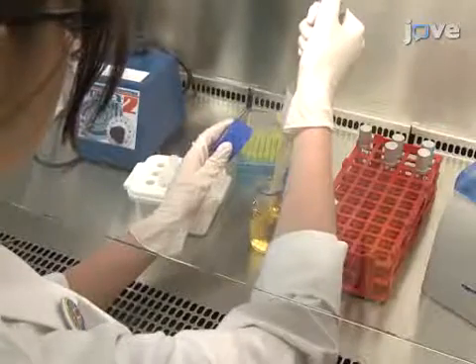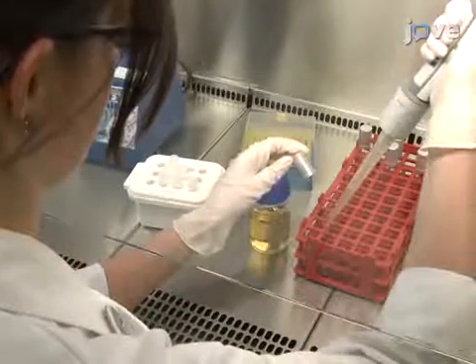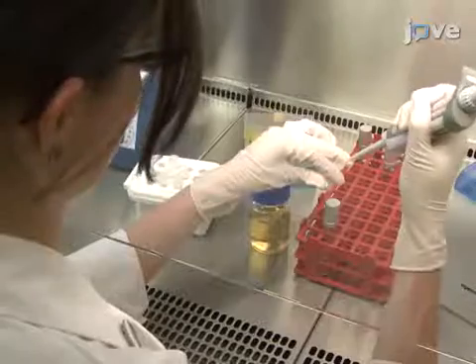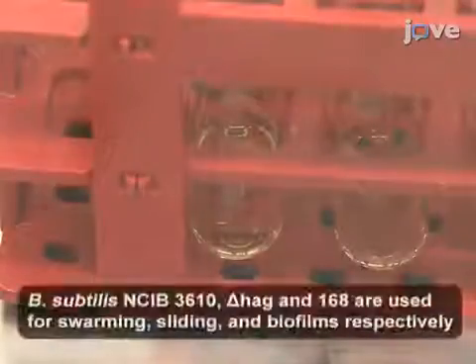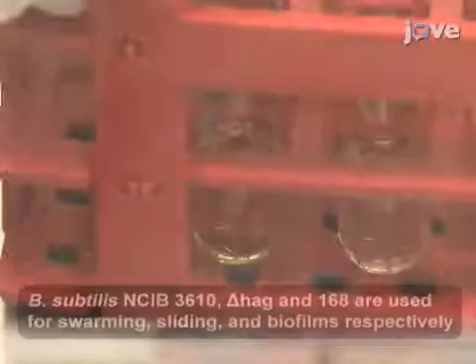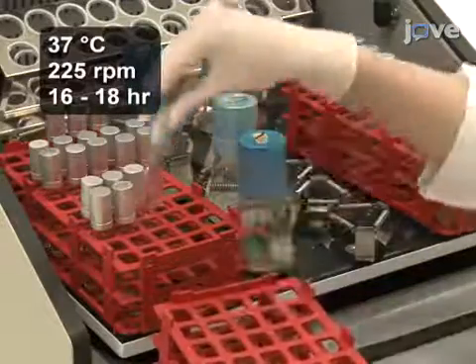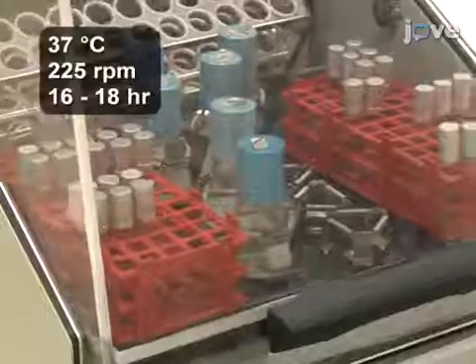On the day before the experiment, add 3 milliliters of LB medium to a culture tube and inoculate it from a freezer stock of B. subtilis. Repeat this inoculation with a separate tube for each strain of interest. Place the tubes into a horizontal shaking incubator at 37 degrees Celsius overnight.